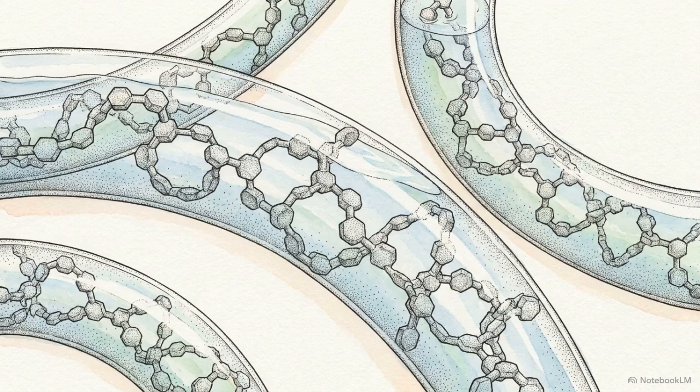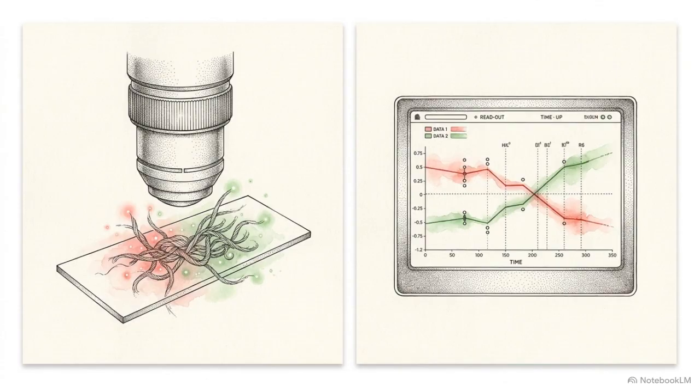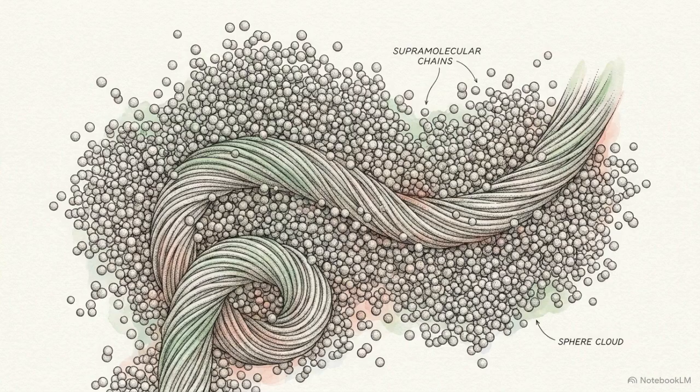This capacity for real-time observation scales to synthetic materials, such as water-soluble BTA supramolecular polymers. A long-standing dogma from static imaging assumed that monomer exchange in these fibers only occurred at the exposed ends or termini of the chain. To test this, researchers designed a 2-color STORM experiment to track monomer exchange in these assemblies over time. The setup involved introducing red-labeled monomers into an aqueous solution of pre-assembled green-labeled polymer chains.